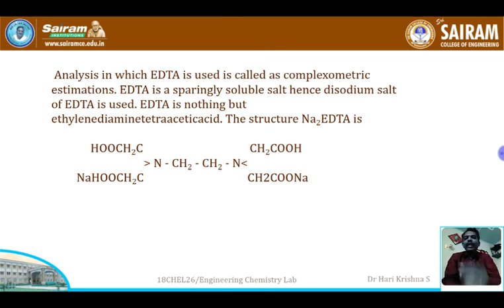Okay. So you're going to add Eriochrome Black T indicator. The exact color of Eriochrome Black T indicator is blue. But when you add Eriochrome Black T indicator, it forms a complex with calcium and magnesium ions present in the conical flask. It becomes calcium EBT, magnesium EBT. So when you add Na2EDTA, the calcium and magnesium will go and react with Na2EDTA and become calcium Na2EDTA or magnesium Na2EDTA. Until calcium and magnesium is present with EBT, Eriochrome Black T, you will get wine red color.